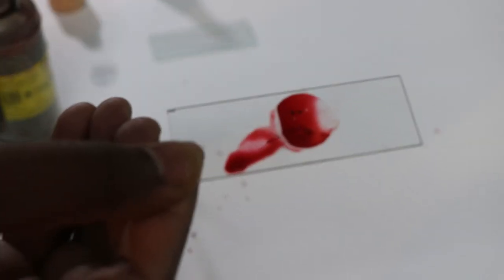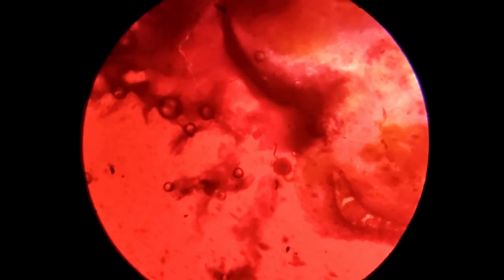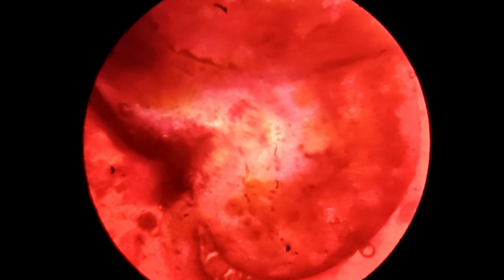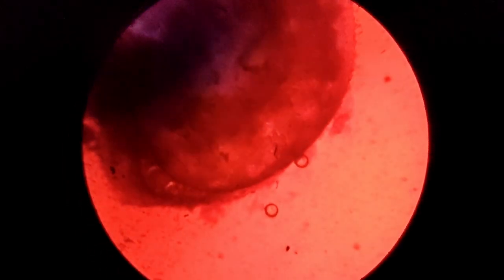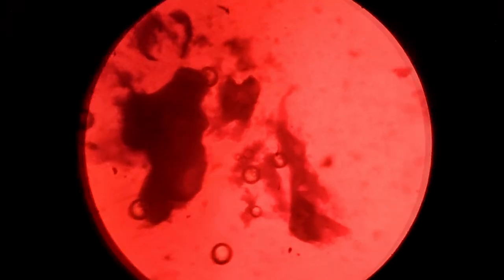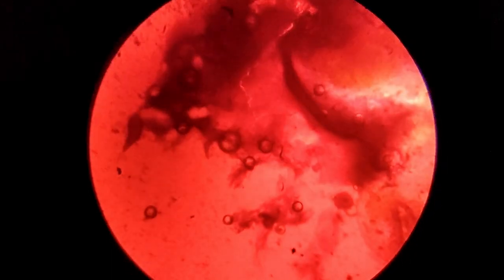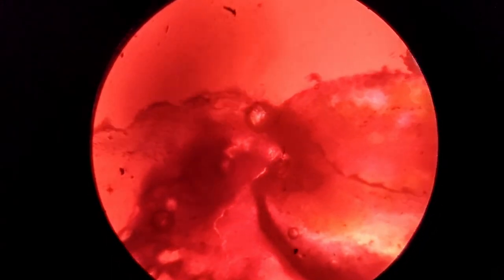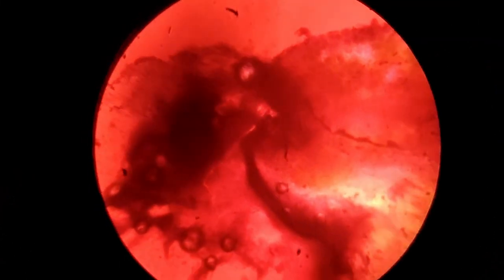Now let us watch this slide under microscope. Here you can see a pollen grain and the part of anther which has been crushed. There are some air bubbles which is very obvious in this slide. The red color is Saffronin solution.